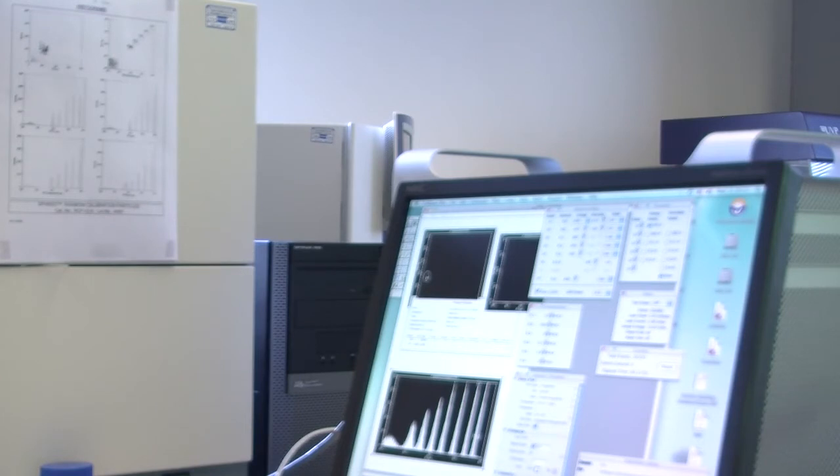Because if the cells are in a really high concentration of antibody, when you spin them they actually catch antibody with them and push it to the bottom of the tube. Whereas if you put it in a bigger volume, there's more space and you don't catch antibody.